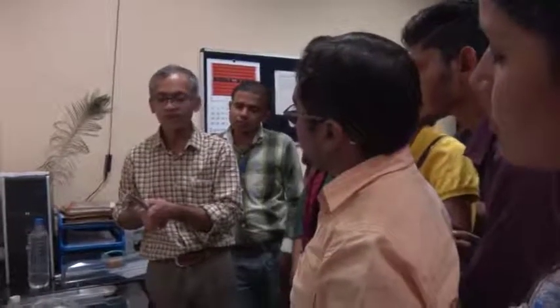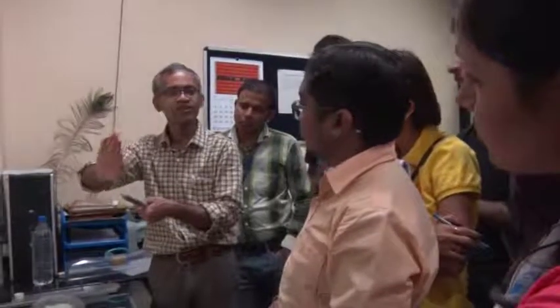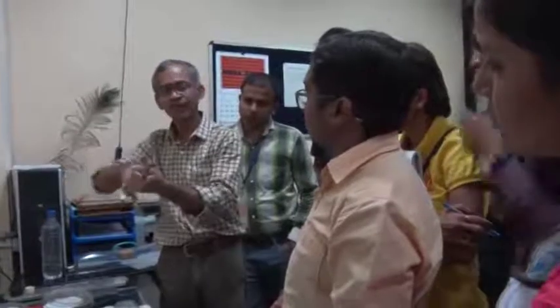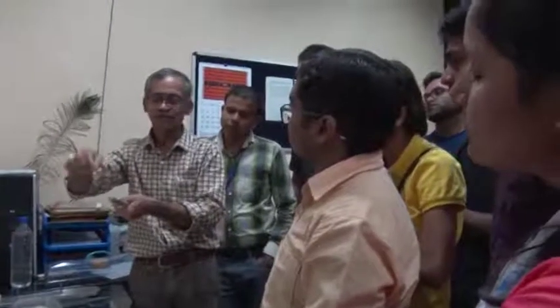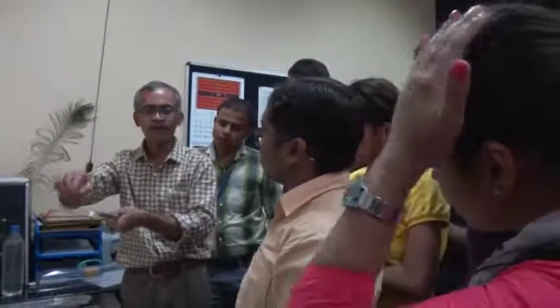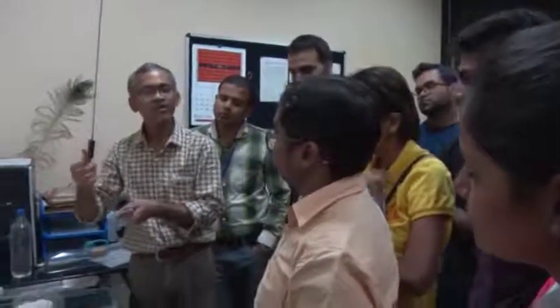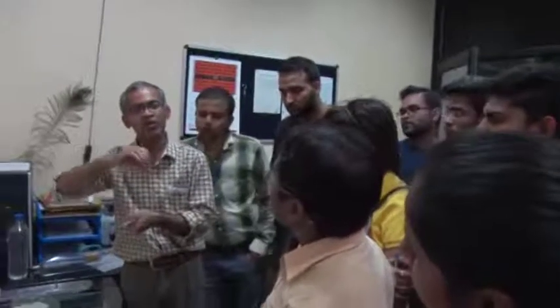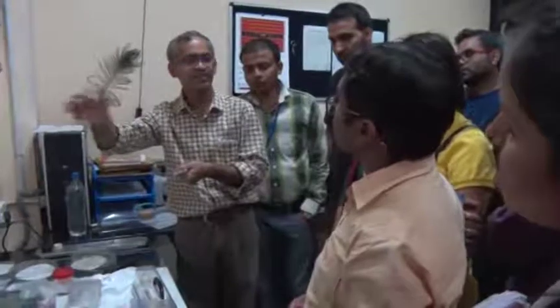In the case of the double tilt holder, there is an additional rotation in this manner also. This one is done by simply rotating the entire holder, whereas this one is not possible in this case, so for that they have a more elaborate mechanism, and with that they can tilt it in this direction also. So this double tilt holder is useful for tilting from one zone axis to two beam condition, and if necessary to the next zone axis, etc.